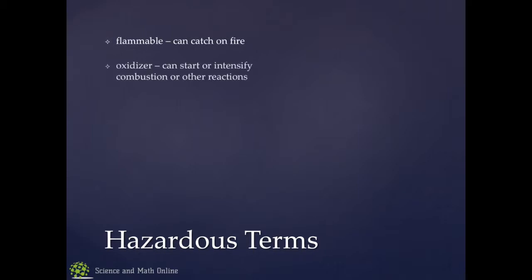All right, some key terms that are important to know. Some of them are obvious, some of them not so much. Flammable, it can catch on fire. Oxidizers are things that can start or intensify combustion or other reactions. Reactive just means it's reactive with something. Sometimes they'll tell you, sometimes they won't. Remember, like sodium is highly reactive with air and water.